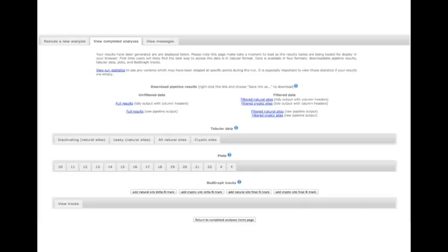These are results generated by the underlying pipeline code itself without any formatting for the web. Pipeline output can be downloaded in what we call a tidy format, or simply as raw output. Tidy output contains column headers. Decimal numbers are rounded to 2 digits after the decimal point. Strand is represented by plus and minus signs instead of zeros and ones, and columns are rearranged slightly.